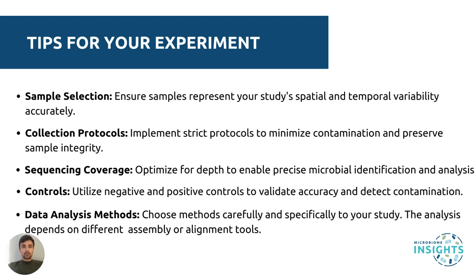Controls are very important to consider, so don't forget to include negative and positive controls to validate your results and detect any contamination or extraction bias early on. And finally, data analysis. Choose data analysis methods that are tailored to your specific research questions. Assembly and alignment tools vary based on the type of study you are conducting. These tips will help guide you through a smooth and successful study from sample collection all the way through to data analysis.